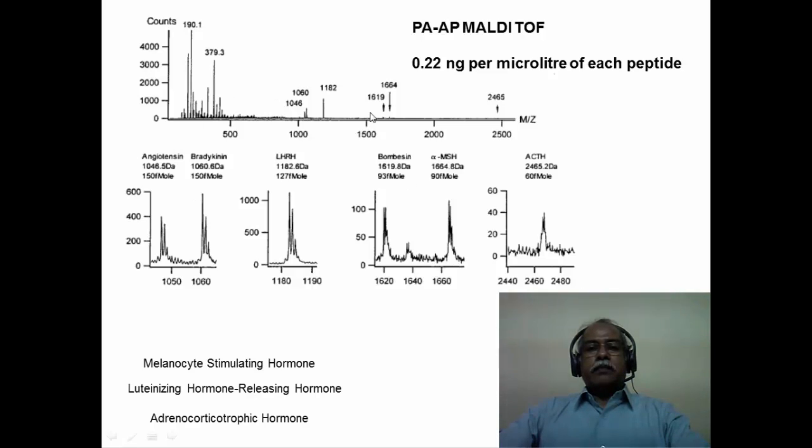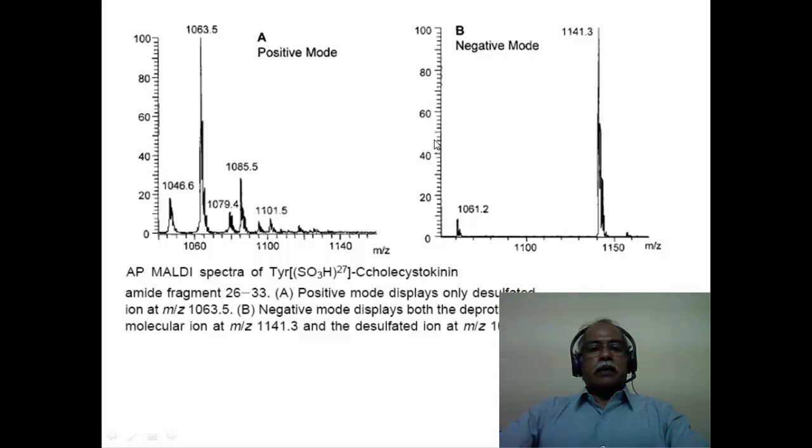This is a mixture of these derivatives that is injected together, indicating that there is a possibility to form molecular complexes of two. In other words, a protein ligand complex can also be formed under these conditions, resulting in the formation of certain molecular adducts which could be detected here.